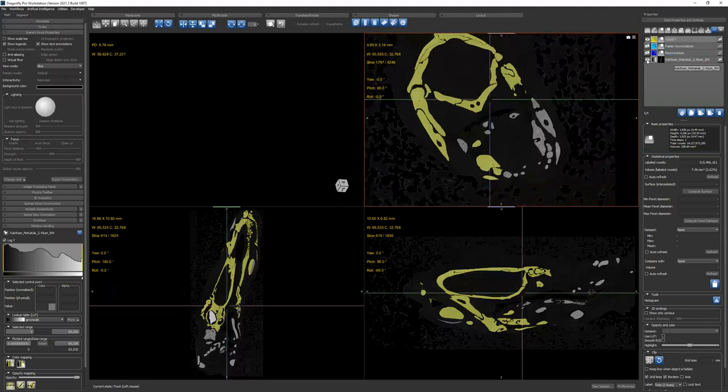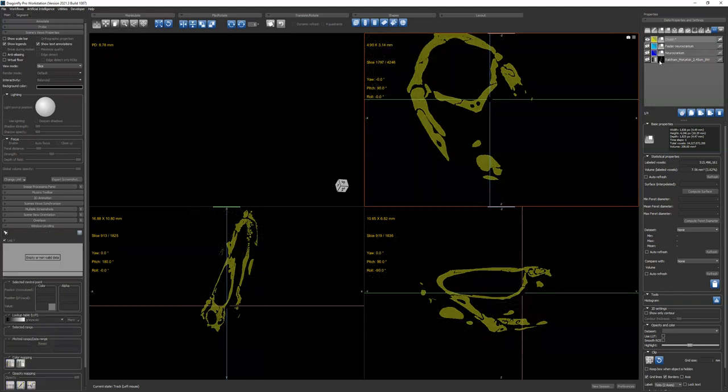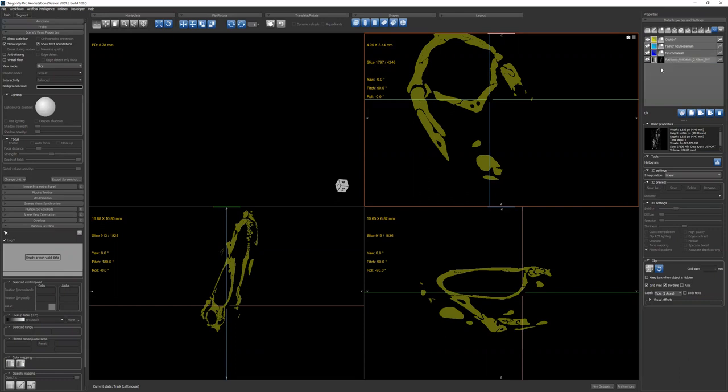So the first step is to turn this original volume off, select it, and hit the second icon that copies it. So copy it. And depending on how big your data set is, it'll take some time, probably.